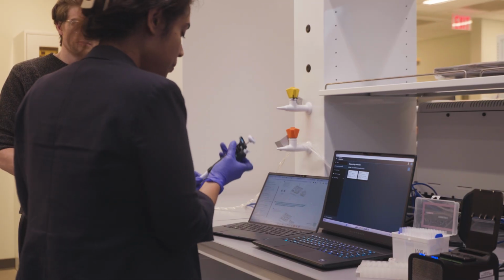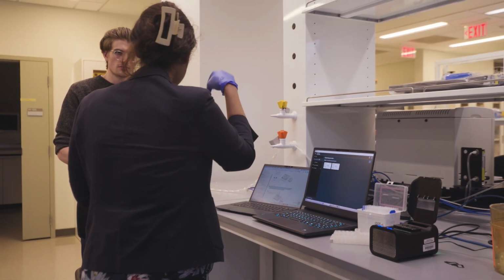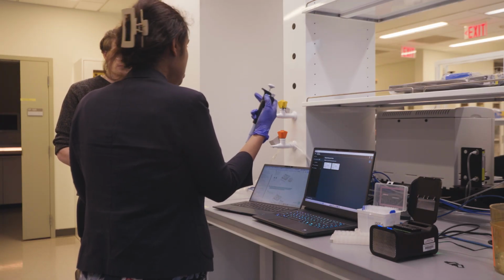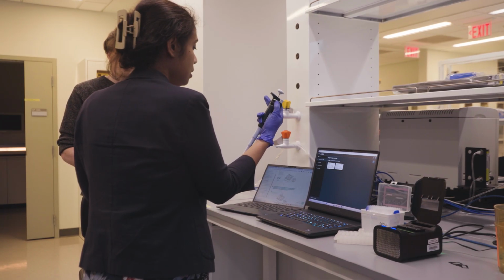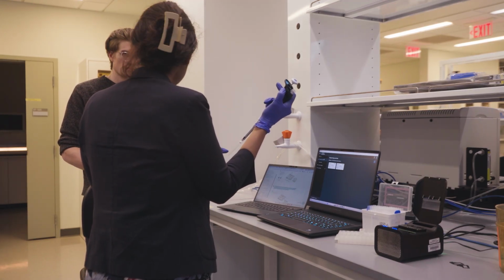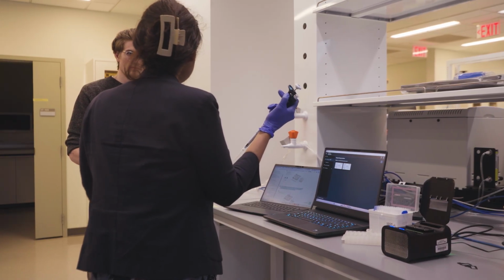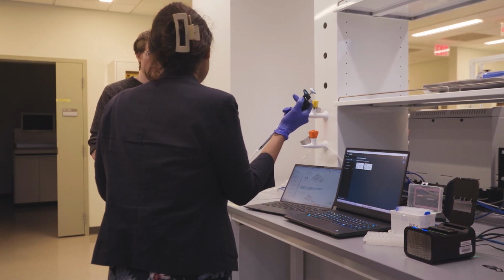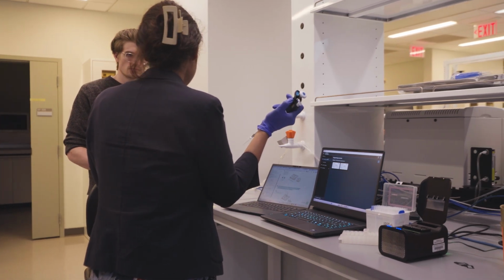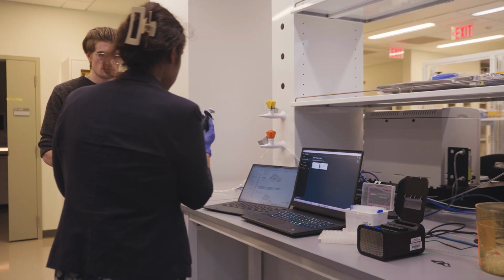First I add one drop there, and then slowly dial it down until just a little buffer is left here. Not everything, because if we push down everything, there is a chance we insert another air bubble. So a few microliters should be left in the pipette tip, and at that time you remove it.